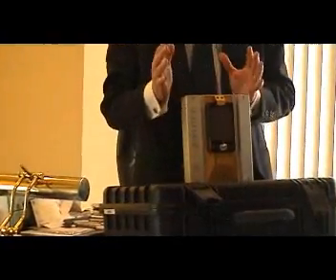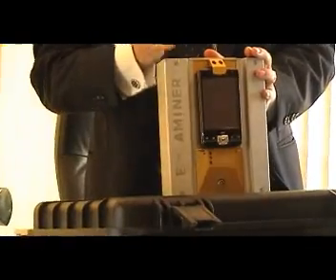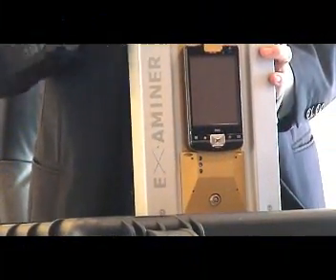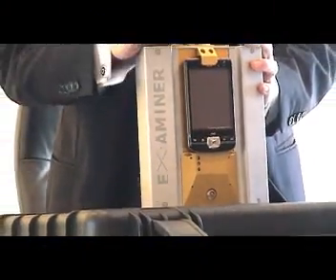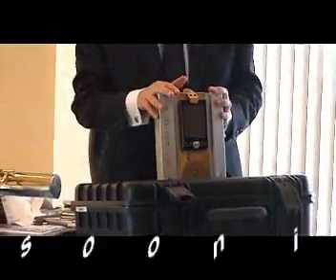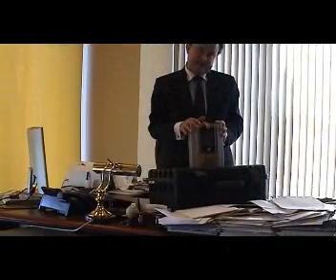I wish that this instrument has a lot of success in the future. We at Applitech like it and our customers told us that they are fond of it. I invite you to use our instrument and test it — please feel free to contact us anytime. We will be happy to demonstrate it to you. Thank you. This was Applitech from Belgium. Bye.